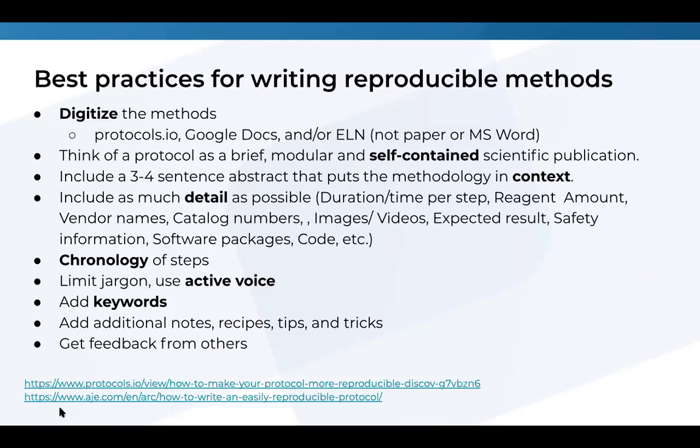Another thing is the chronology of steps. So make sure your steps are in chronological order. Don't try to mix up that order, because it's really important for others to follow it in chronological order.